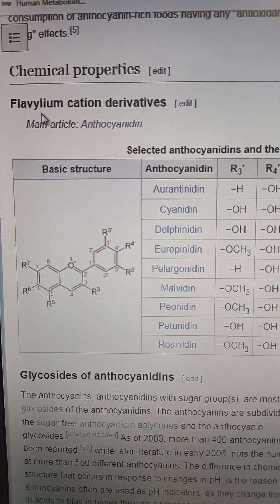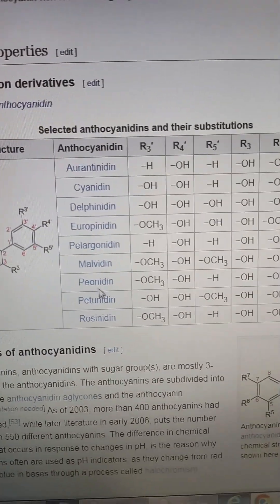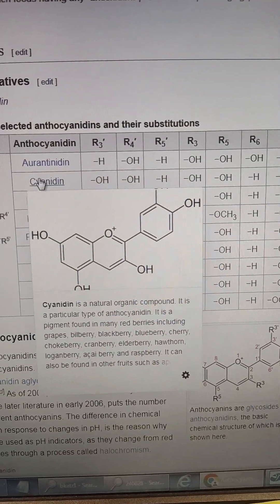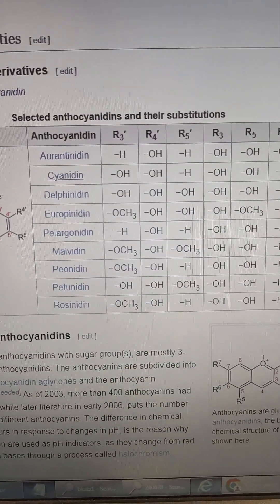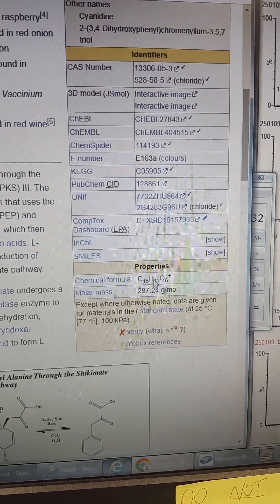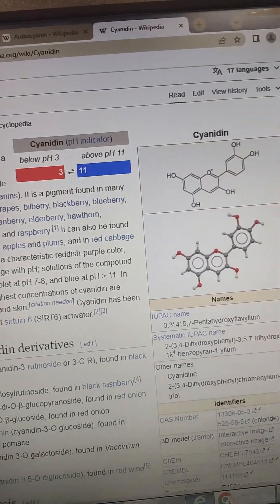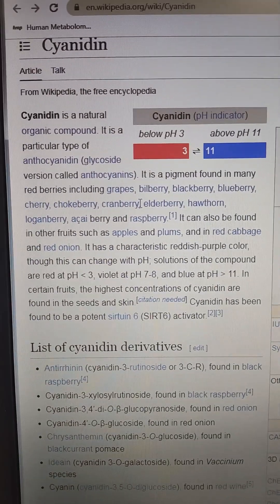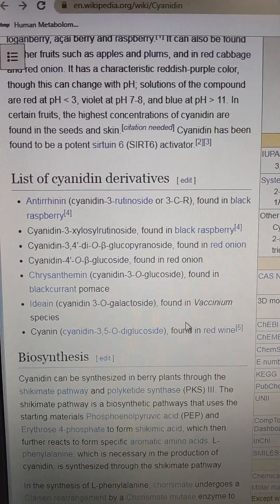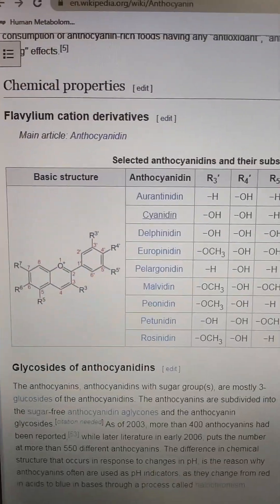So anthocyanins typically are sugars conjugated to flavones. So this is the 287 base flavone. The anthocyanins, the flavonium ion, the base flavone. You can have all these different masses. Cyanidin is the mass of 287. So this is going to be a cyanidin base pigment, which are typically reds and blues and things like that. So I think that, they typically are found in fruits as well. So pretty, makes sense. Makes sense that it could be a cyanidin.